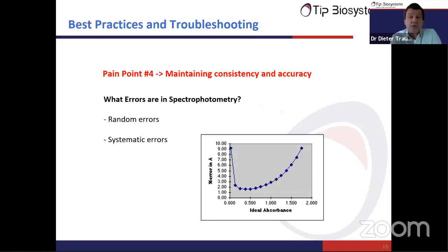So you have to think very clearly if you choose the right method, and if there is something there that can interfere with your sample, and so on. But the good news is that systematic errors can be eliminated. Sometimes, as I mentioned with your pipette, you can recalibrate the pipette to remove this error, or you can recalibrate the spectrophotometer for the right wavelengths, and so on.